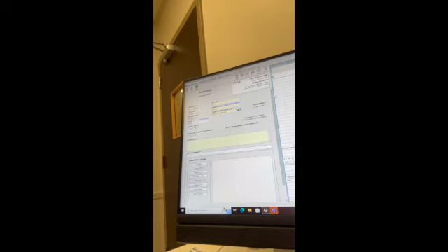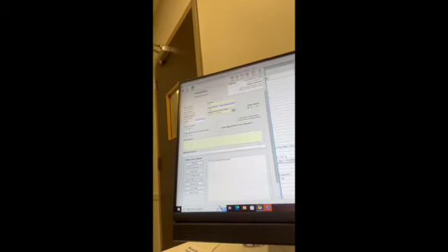So this would be for our CBC panel. The patient information is located here. We would choose an EDTA tube for our CBC. We would be obtaining a venous source. We would select the date and time. It is a fasted sample. We have no concern for zoonosis, and then we would input our patient information and history, and then select CBC. That's how we would input our blood work request.